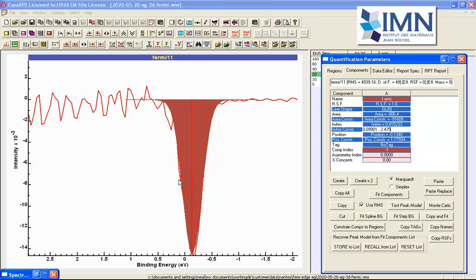So the response of the instrument and the X-ray source and the thermal broadening is reasonably well modelled by a Gaussian, and the Gaussian in this case has a full width half maximum of 0.42 eV, so this is similar to the result that was obtained by fitting a complementary error function. There may be slight differences because the fit of the complementary error function also included an offset, whereas in this case it's a fixed 0 background type, and the fit of the Gaussian is relative to this 0 rather than an offset.